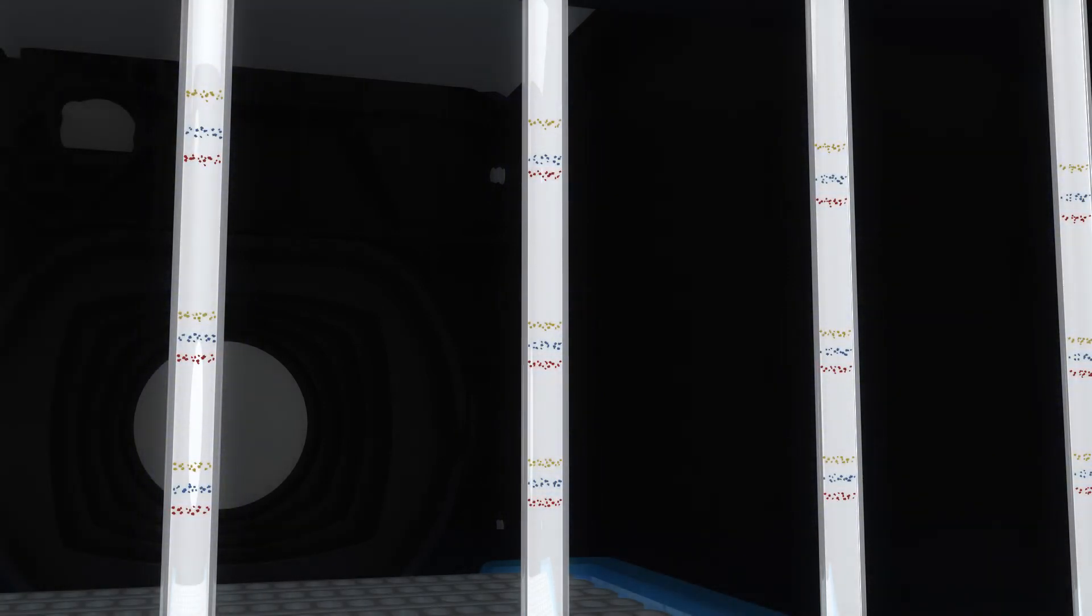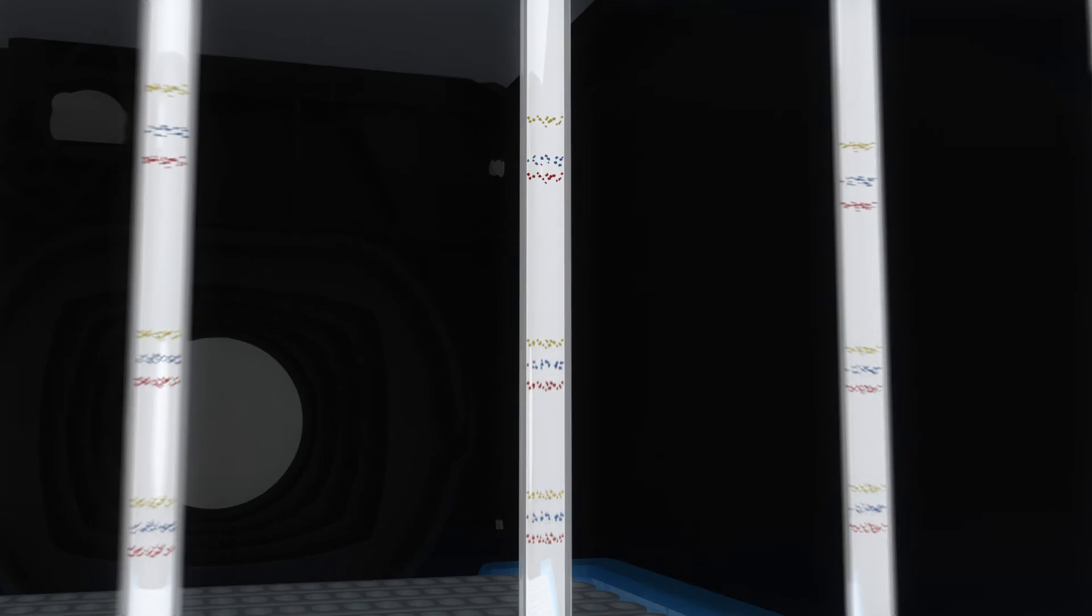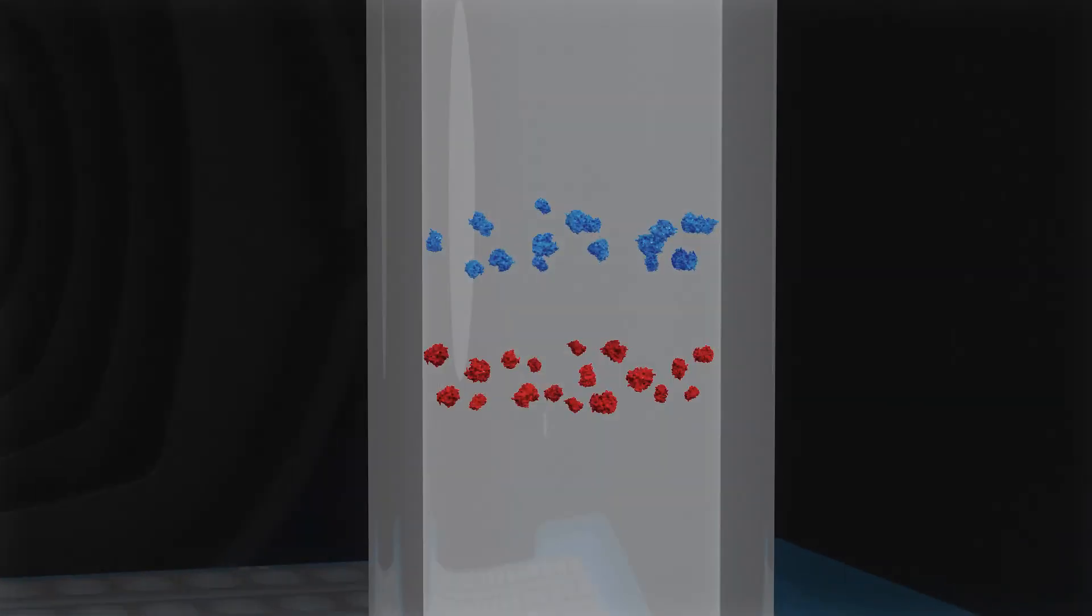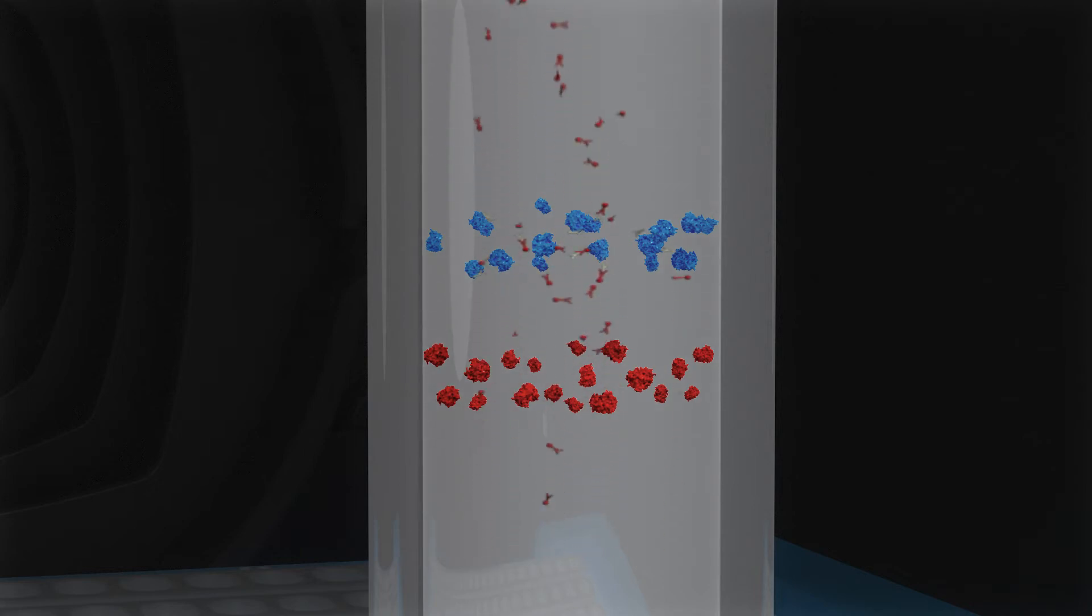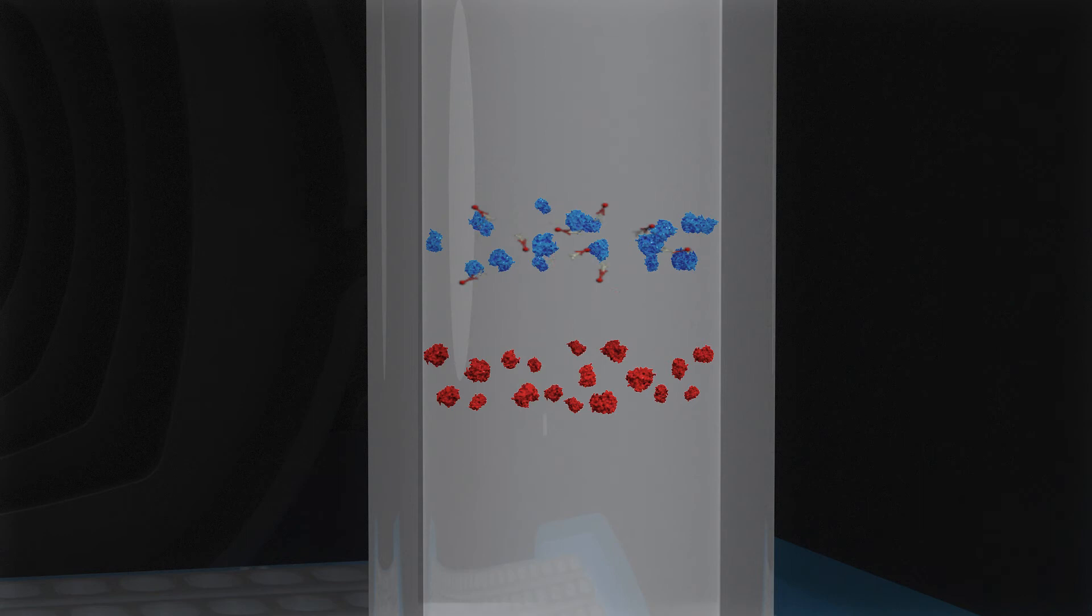With proteins now ready for immunoanalysis, Abby starts the immunoprobing process. During immunoprobing, the samples are incubated with a primary antibody, followed by an HRP-conjugated secondary antibody, and finally, a chemiluminescent substrate.